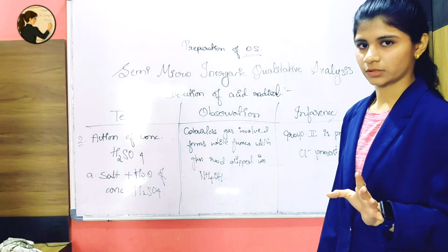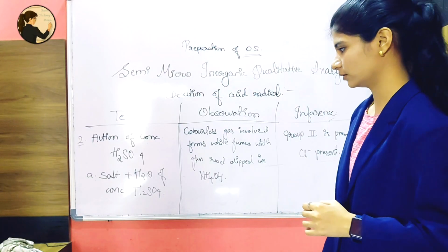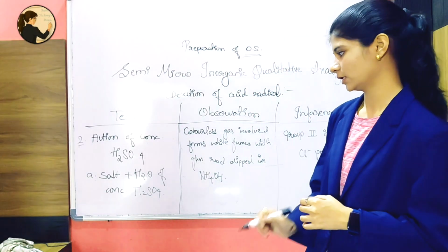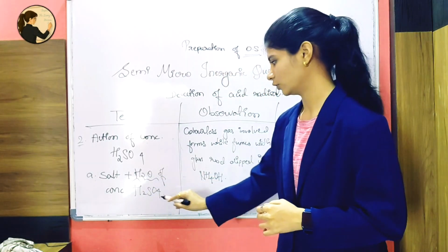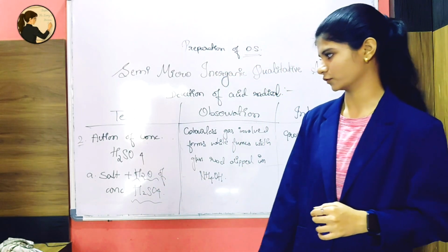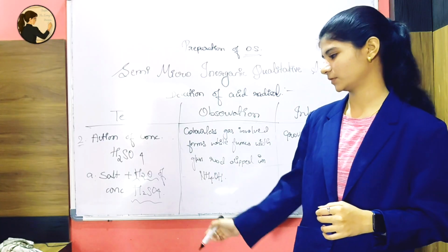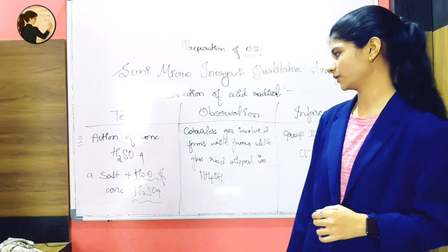You will not throw it, okay? You will take another test tube and put some amount of salt and add concentrated H2SO4. Again the same thing comes, right? That's why what will you do?